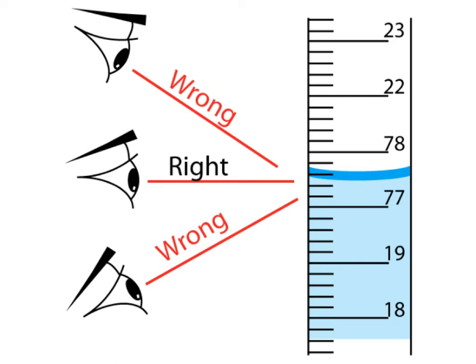When you're actually reading the volume of a liquid on a graduated cylinder, it's critical that the cylinder sits on the bench, that you don't hold it in your hand. It needs to stay flat on the bench so it's still. And then you need to have your eye at the same level as the bottom of the meniscus. So you need to crouch down to get your eye right. You do not want to be looking above the meniscus because you're going to get the wrong reading, and likewise below the meniscus. So you want to aim to get your eye right on the mark. So that means you're going to have to adjust your body.